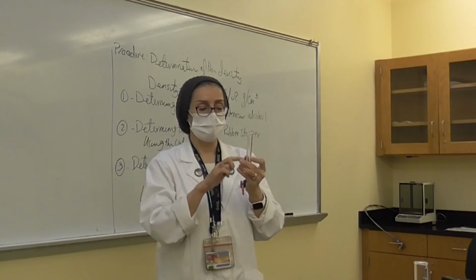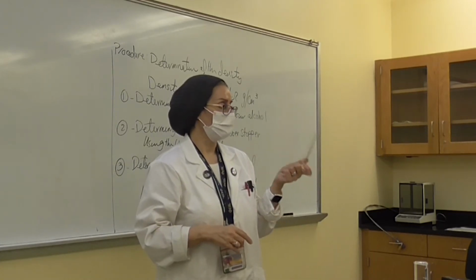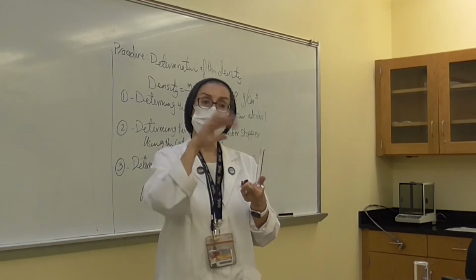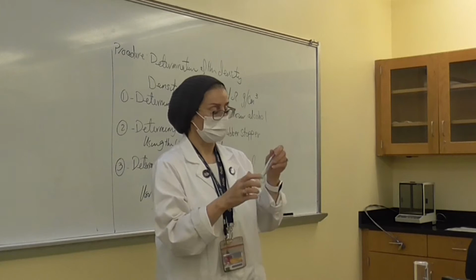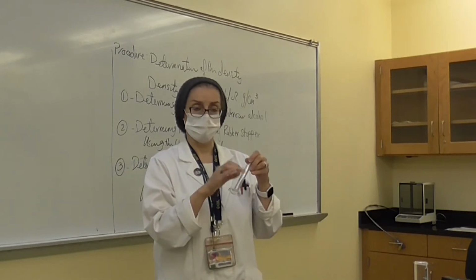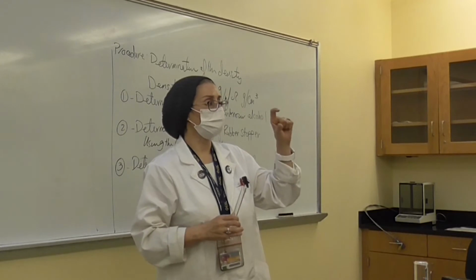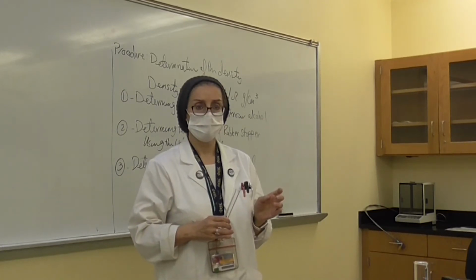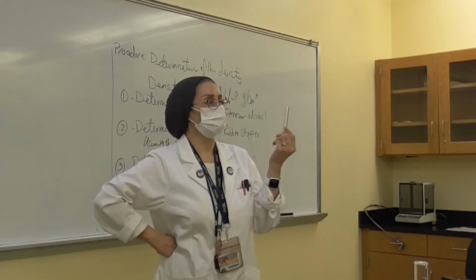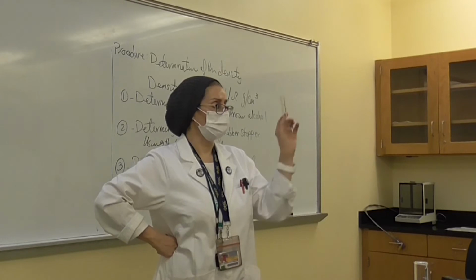5 to 6 milliliters. But first you have to measure it when it is empty, and you have to measure it with the liquid. Then you subtract the weight of the container. That will give you the weight of your liquid. Got it? How about the volume? How are we going to measure the volume of that liquid in the cylinder?